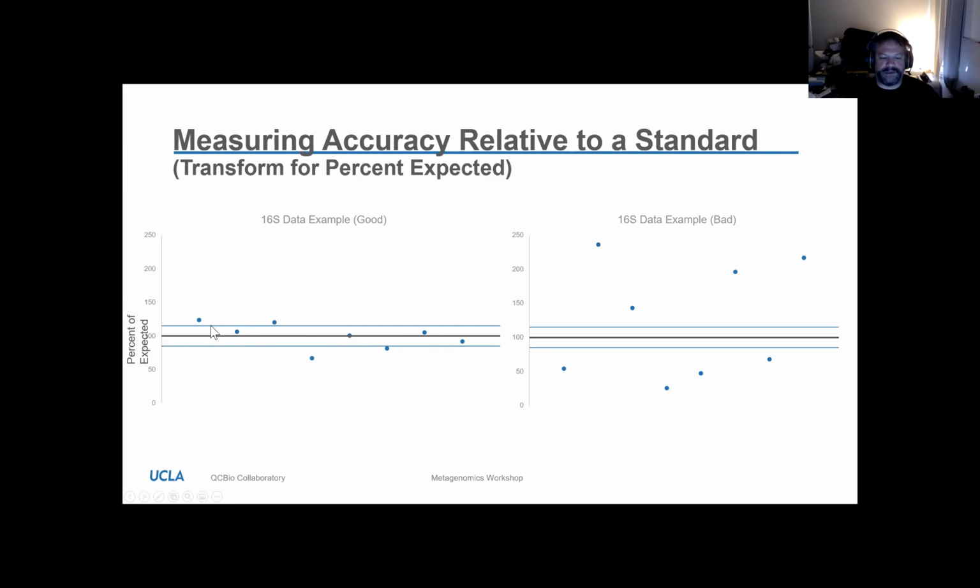We have what I call this band of tolerance again. So this goes 15% either direction, which means it goes up to 115 or down to 85. And the good still looks very good. In fact, if we look at the good, we realize everything is in or near this band of tolerance. So this band of tolerance again is where it's as accurate as the standard will let me say it is, considering its manufacturing tolerance. In the bad extraction, we see that nothing is inside this band of tolerance. Everything is way off.